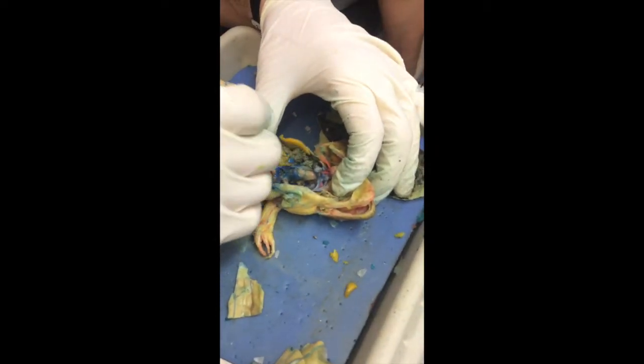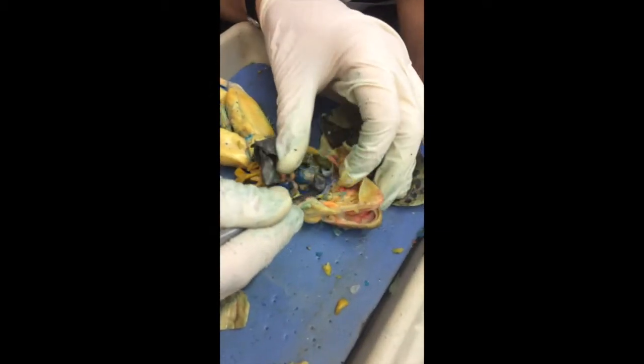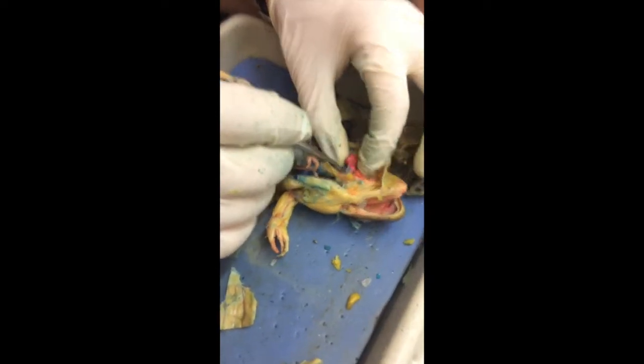Okay, that's the heart, and we've got the lungs, 1 and 2. Oh, it's so tiny. Over the heart. Okay, that one. They're holding on to that.